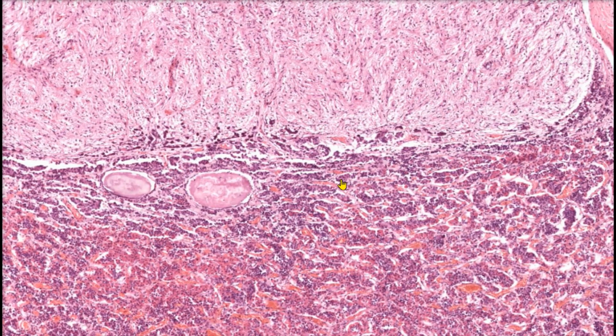All right, so up front we can see the anterior pituitary, which is also sometimes referred to as the adenohypophysis. This part of the pituitary has a darker stain and is glandular in nature. It produces growth hormone, prolactin, luteinizing hormone, follicle stimulating hormone, thyroid stimulating hormone, and adrenocorticotropic hormone.